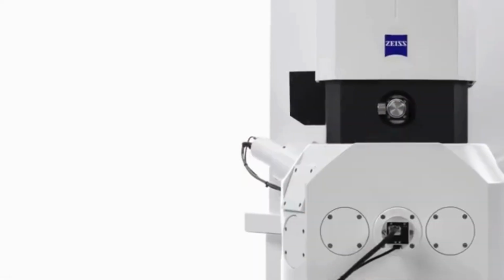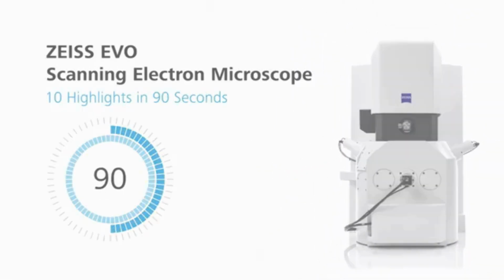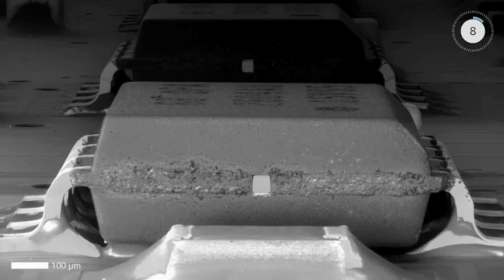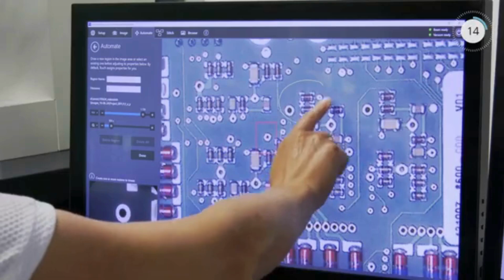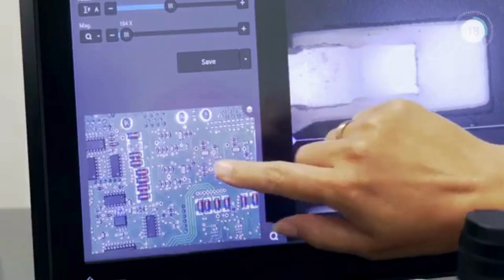Evo Scanning Electron Microscope, 10 highlights in 90 seconds. Examine samples down to the nanoscale to reveal greater detail in routine inspection and failure analysis. Enable success even for novice users through intuitive imaging controls and easy navigation.